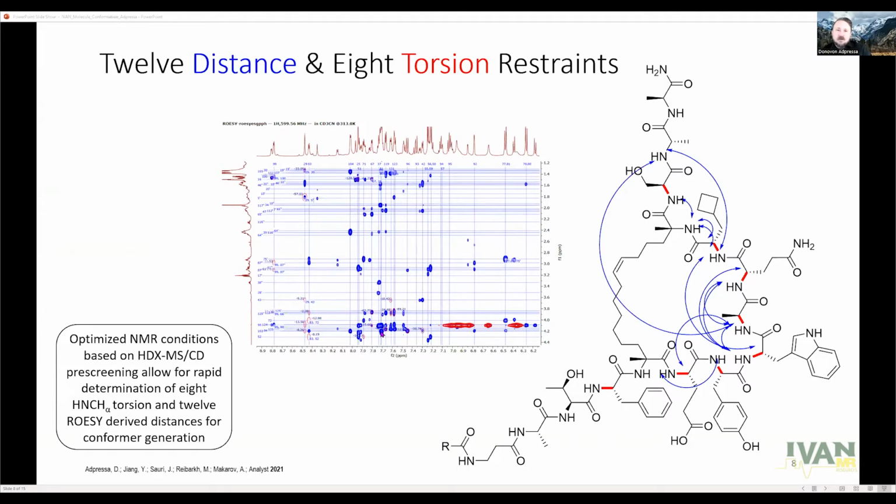And so we can return back to our model and say, well, we think we see a ROESY peak here. Is that really a cross-ring ROESY that we see? And is that explicit or implicit at that point? It starts to blur the line since we have less confidence in it. But does that answer your question, Misha? Oh yes, very much so. Thank you. Fantastic. Of course, it's very natural to go from implicit validation into refinement, and the line is indeed blurred.